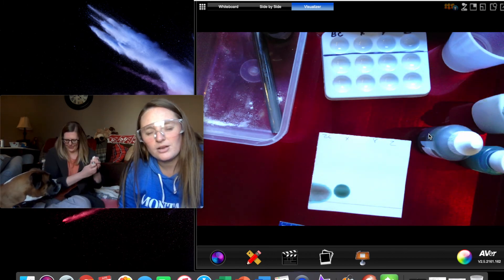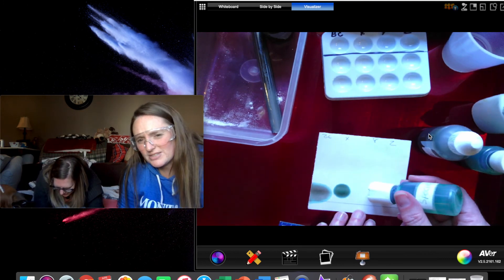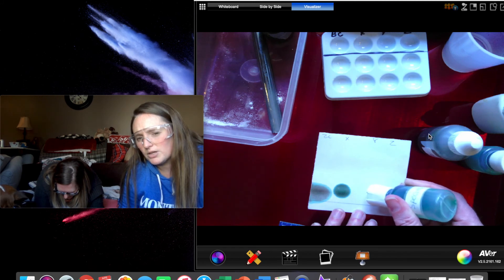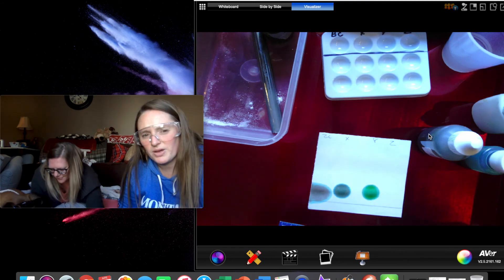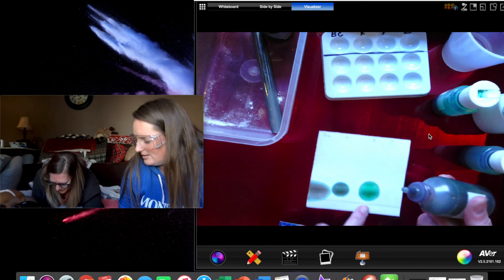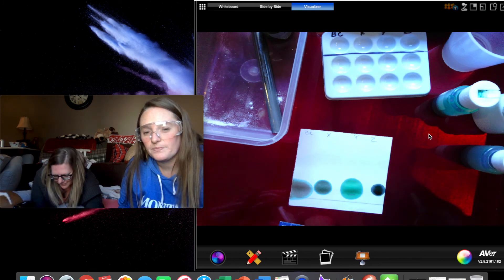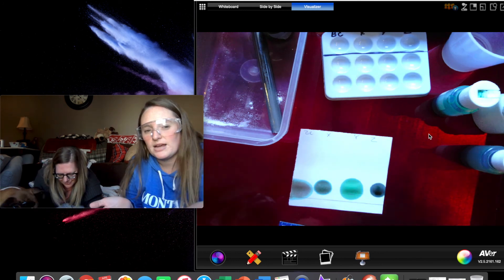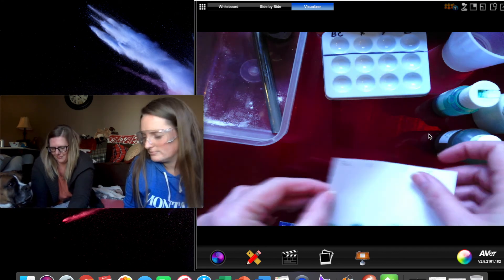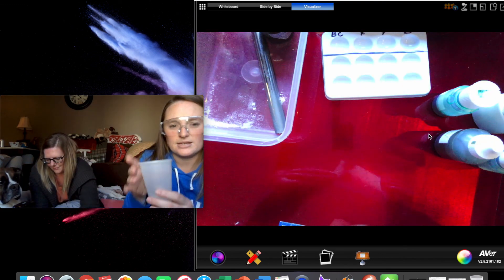Cooper is very into science. Even if the drops end up spreading, it's not a big deal — they will separate out the way they're supposed to. Now that we have our four drops, we're going to take the paper and fold it hot-dog wise.